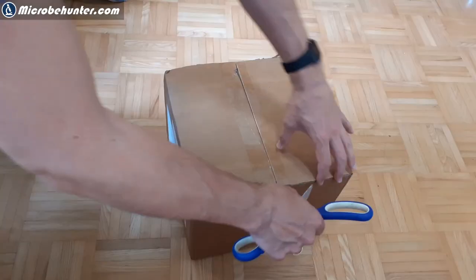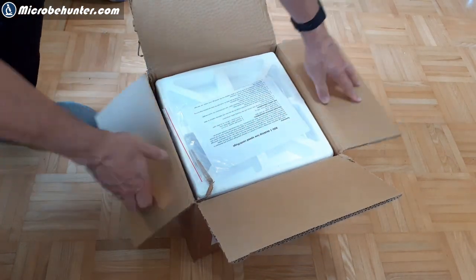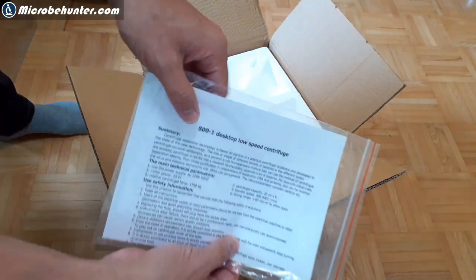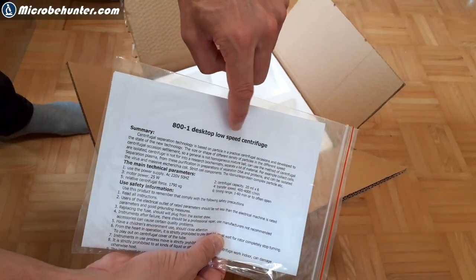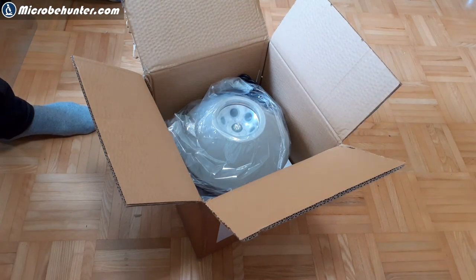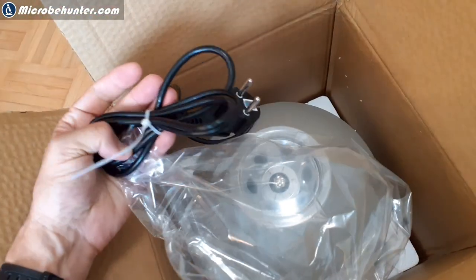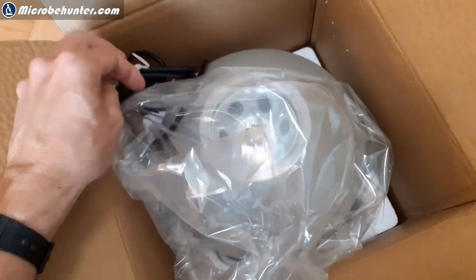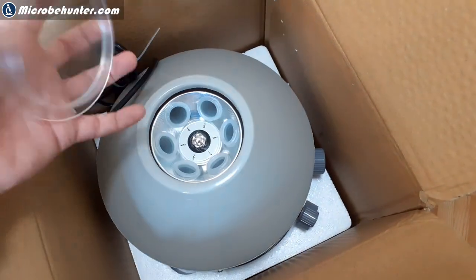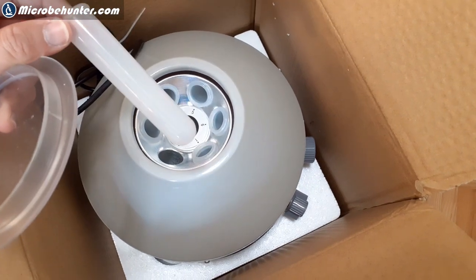The centrifuge arrived after not even a week in this box. I ordered it over eBay. This is the instruction manual in English, but as you're going to see, in pretty bad English. That's the centrifuge itself. It's not quite as small as I expected, but it was not very heavy either. The power supply cord is correct for 220 volts. And there are these plastic tubes in there — 20 milliliters.